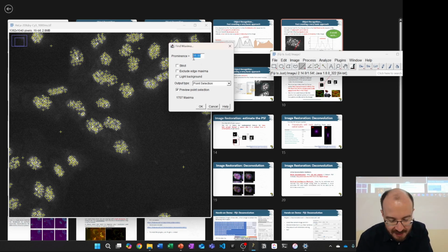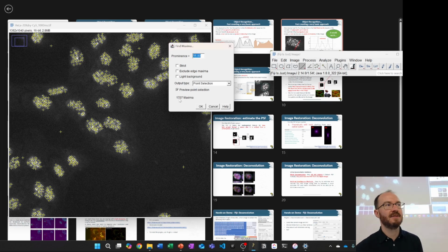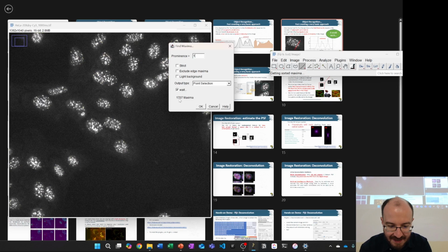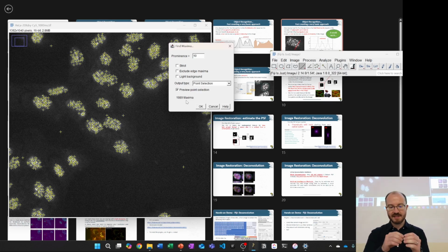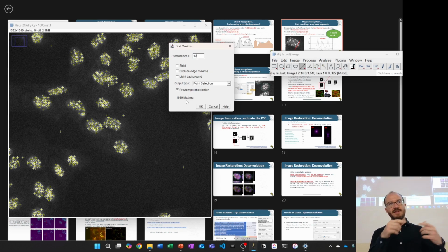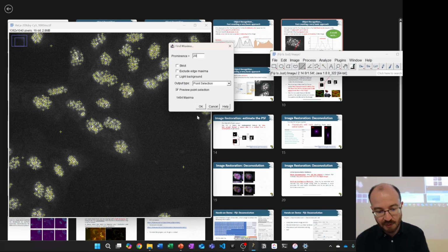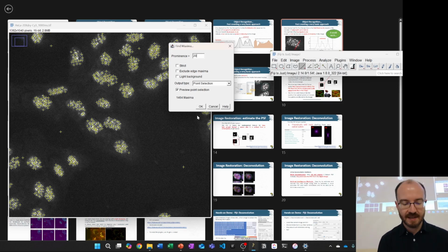So what would happen if I change this prominence? Let me just quickly think about it. If I was to make this prominence less, let's say to 10, would you expect this number of maxima to increase or decrease? Yeah, so let's see, it's going to increase because now the prominence is lower for it to consider it a peak. It's not forcing it to go as far down from one peak to another peak. If I make it more, let's say 20, now there are fewer peaks because it has to go further down before it actually considers two peaks separate from each other.